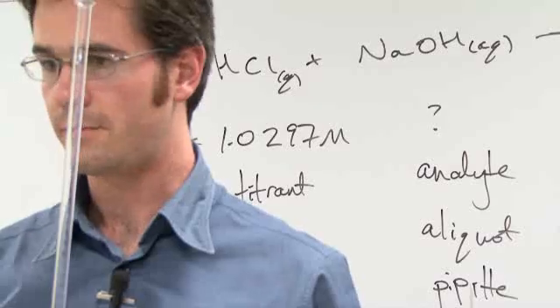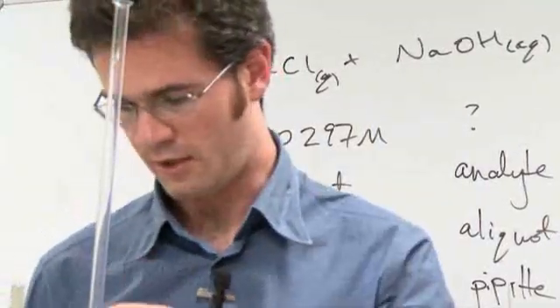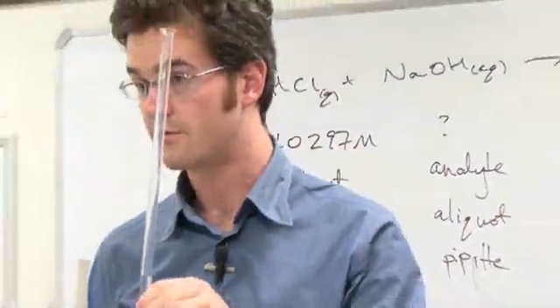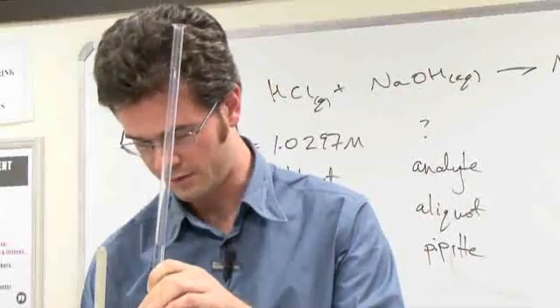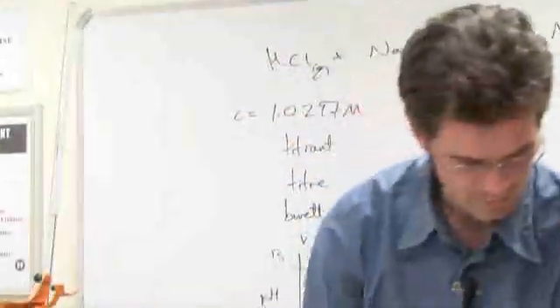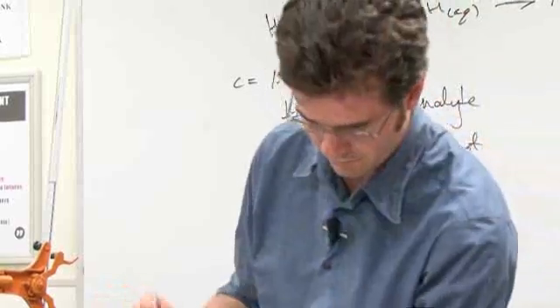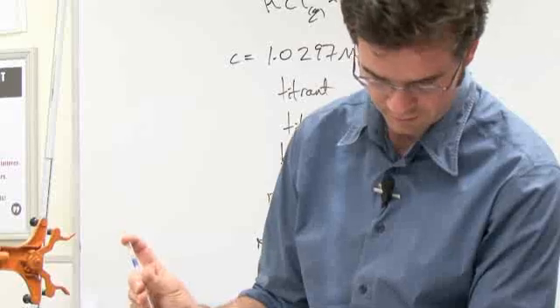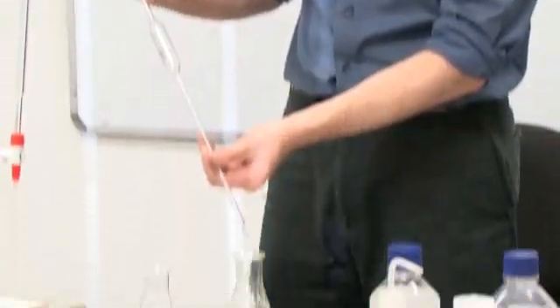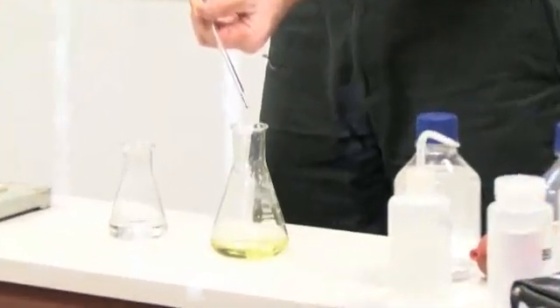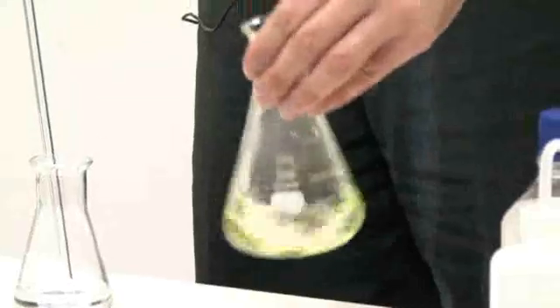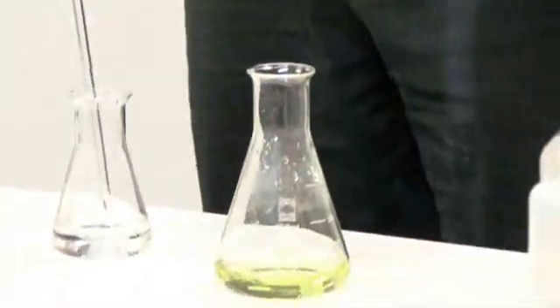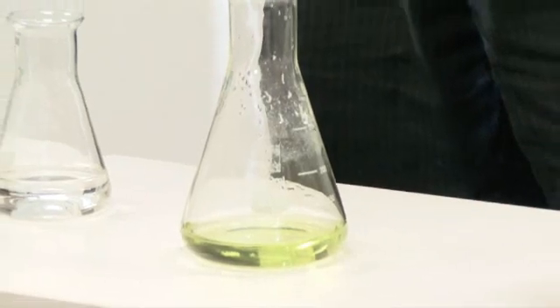Every drop of water from a pipette or a burette or an eyedropper is 0.05 mils. So you can get an eyedropper. I don't have one on me. So I'll cheat. So every drop of sodium hydroxide from here will be 0.05 mil. You shouldn't use a pipette. You should use an eyedropper. I don't have one on me. But if I take one drop. Give it a swell. So I added 0.05 mils.